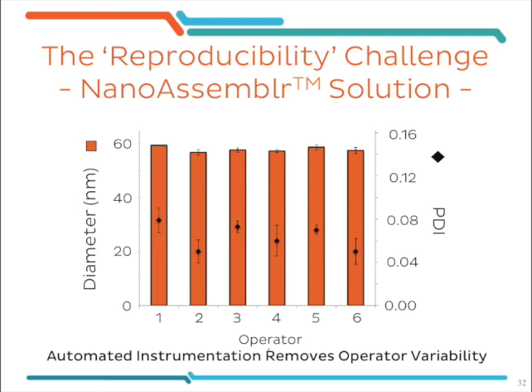And usually, in scientific presentations, we like to show a fancy peak or a drop down to show a difference, but here the aim is actually to show the opposite. You can see in this graph that when you use an automated instrument that is software controlled, you can get the same results and achieve excellent reproducibility no matter who operates the system and what their educational background is.